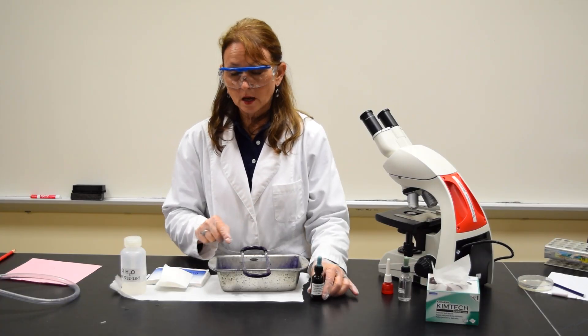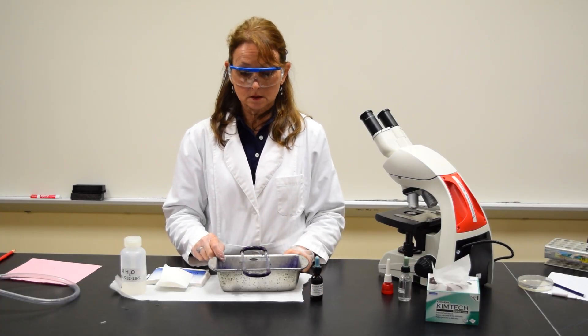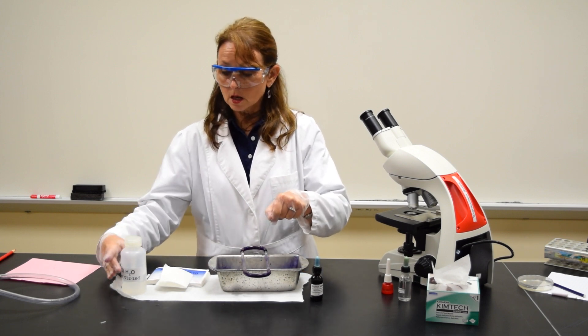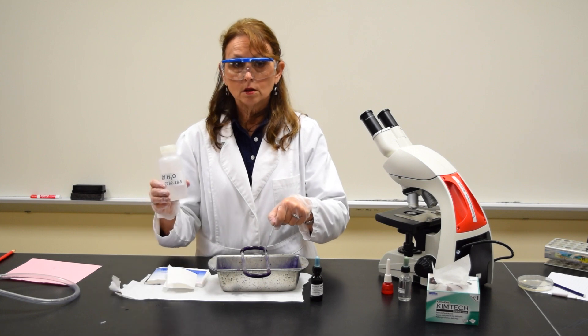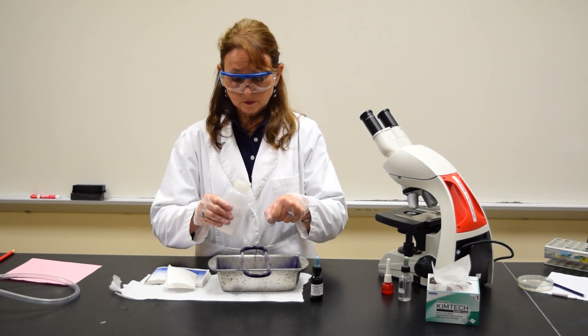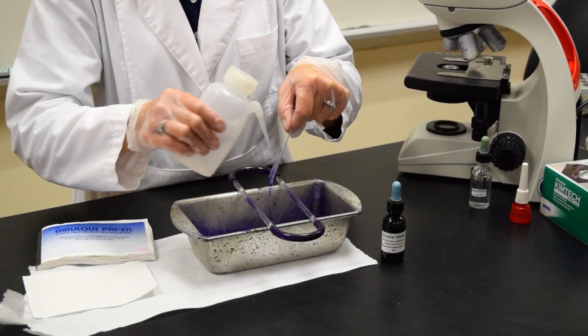Allow the stain to remain on the slide for 30 seconds. After 30 seconds, tilt the slide over the tray. Using the large bottle of deionized water in the squirt bottle, you want to rinse the slide.